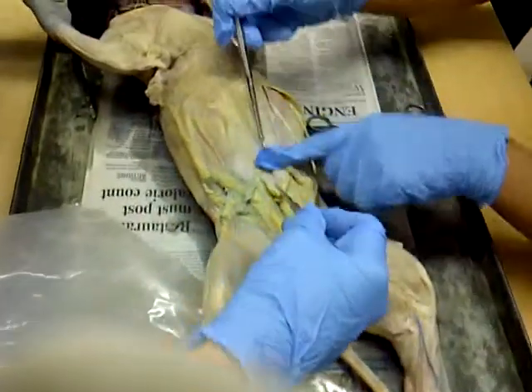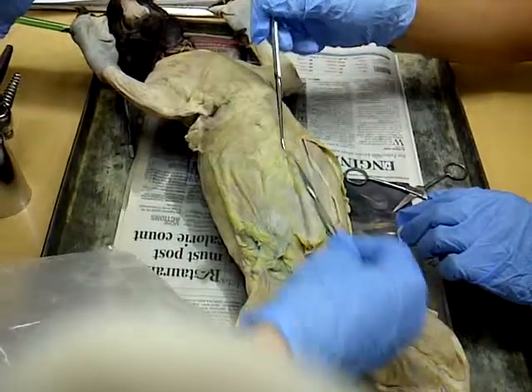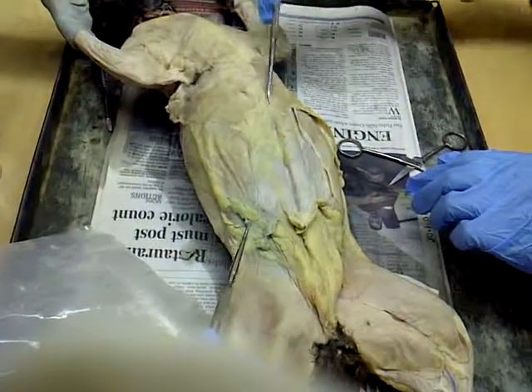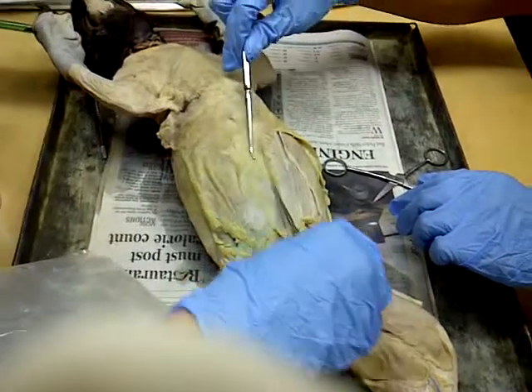The middle line right here is the linea alba. Down the middle is the linea alba. Now these sections right here, the long parts, are the rectus abdominis. This right here is the rectus abdominis, and this is the rectus abdominis. It's on both sides of the linea alba.